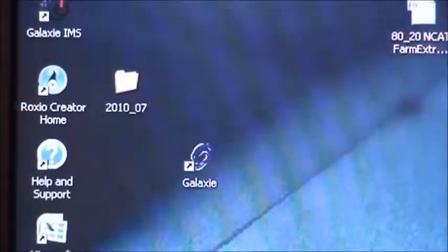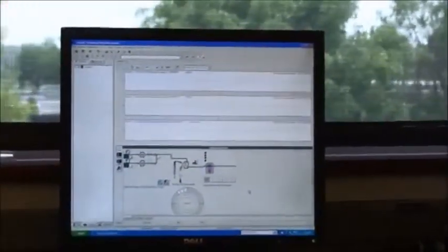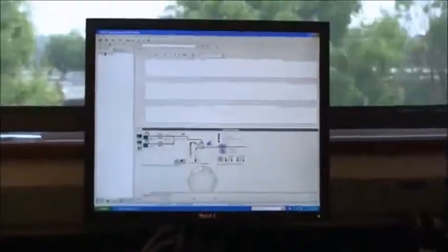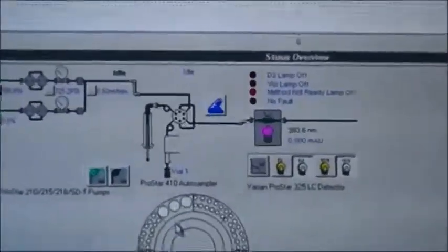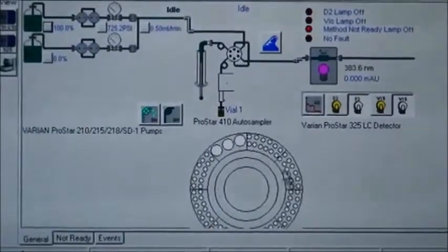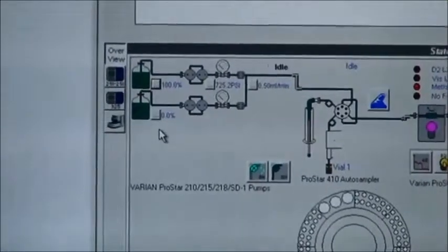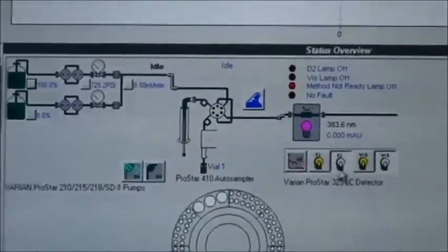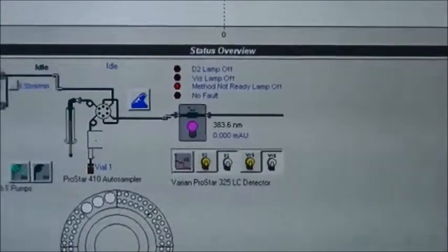To run the HPLC unit on this computer, the software is the Galaxy software. You come over here and turn the software on. The first screen shows all the components of the HPLC unit: the auto sampler unit, the two pumps A and B, and the detector. These lines show how the solvent pumps through the system and through the detector.